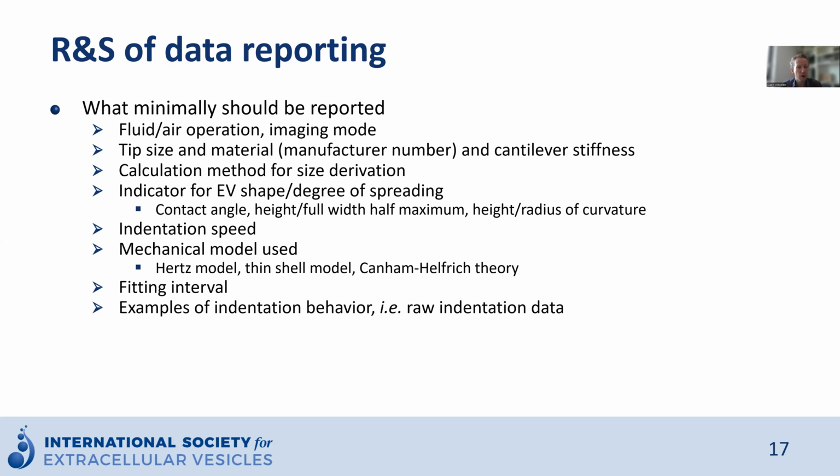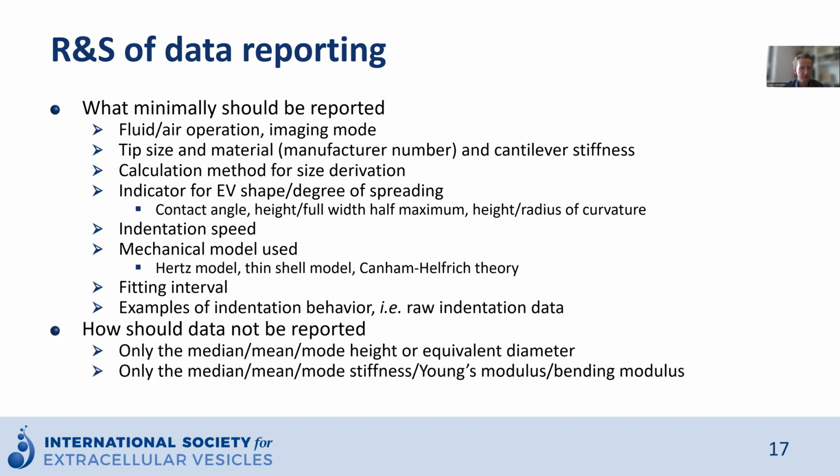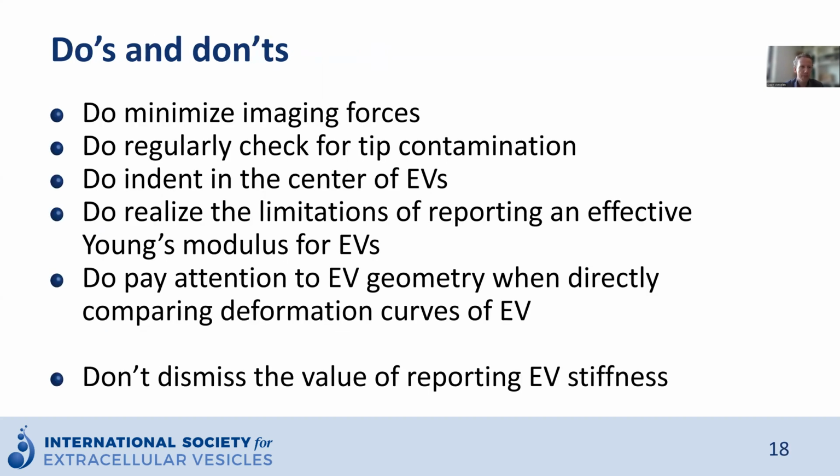Report the fitting interval, and also provide some examples of the indentation behavior. So refrain from just reporting the median, mean, and mode of either the height, diameter, or Young's modulus of particles. Some explicit tips are also summarized on this slide. All of these I've already mentioned during the presentation.